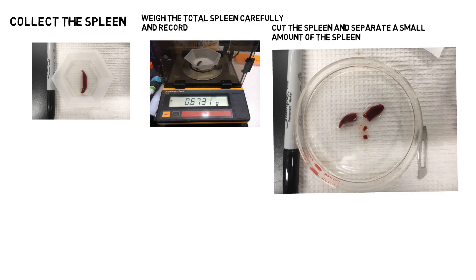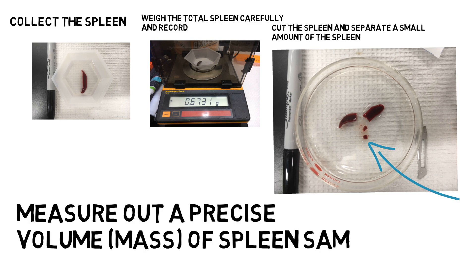Then, using a scalpel, dissect the spleen about the centre and remove a small piece as shown on this image. The goal is to take a piece small enough to be able to create a single cell suspension, but not so large that it is hard to chop up. You must weigh the separated piece carefully so we know its precise weight.